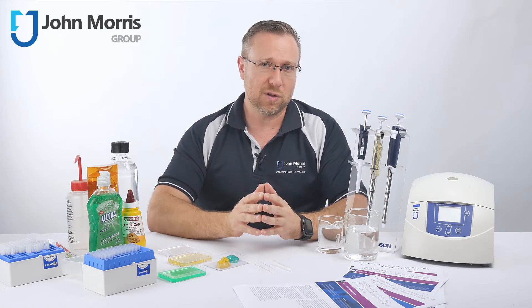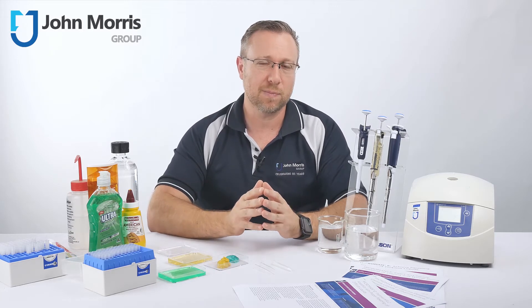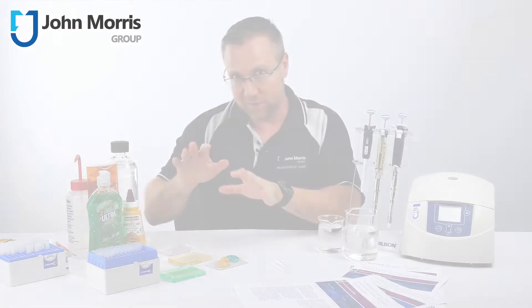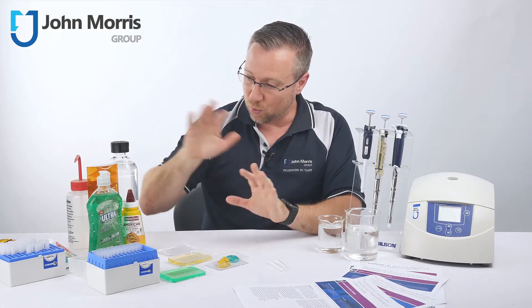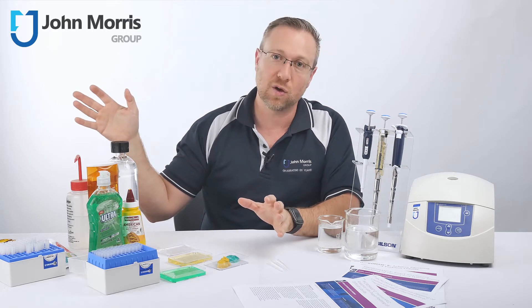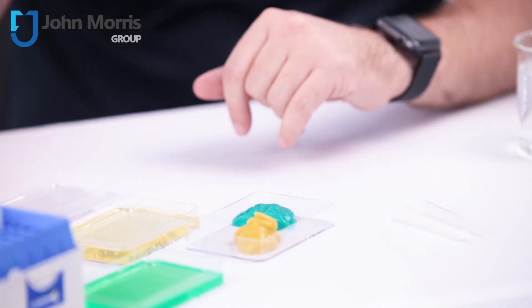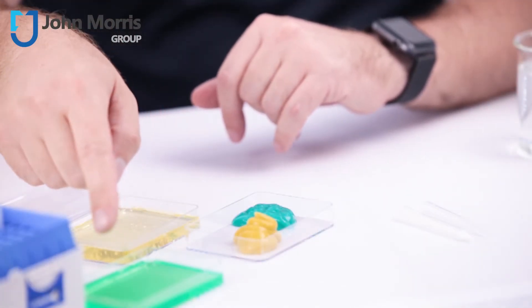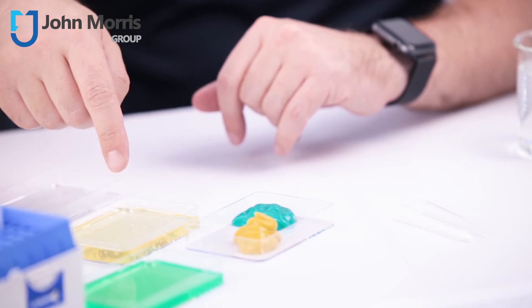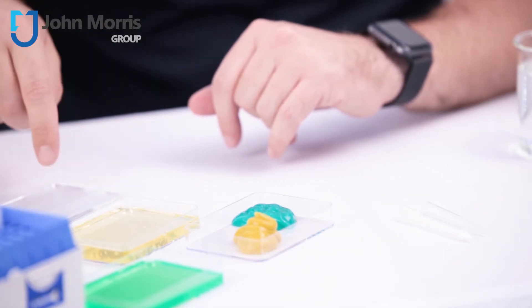Now that you're armed with this knowledge, we wanted to show you some examples in real life. We've got a range of common household items available from any local supermarket: some toothpaste, some mustard, some liquid detergent, some shampoo, and also some methylated spirits.